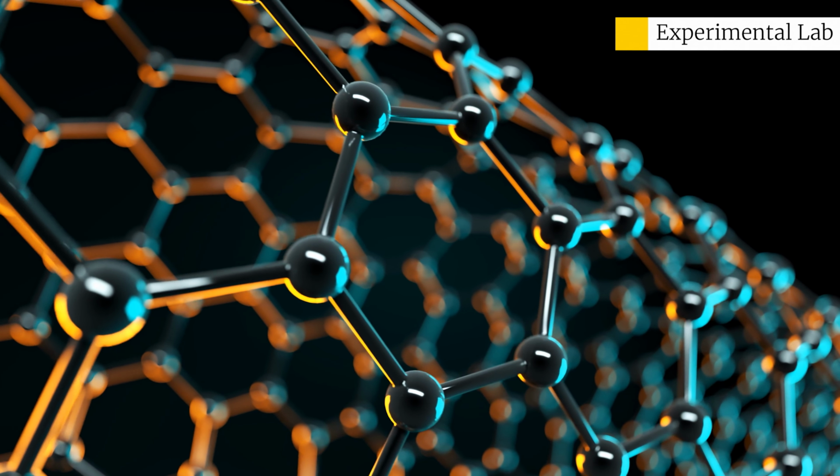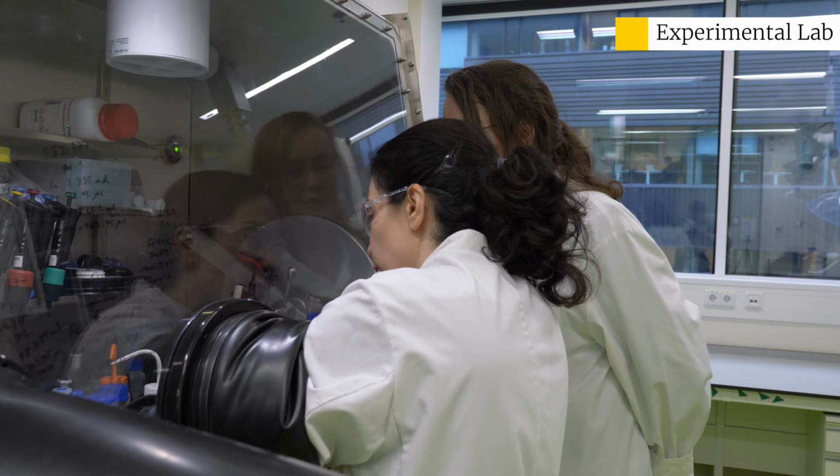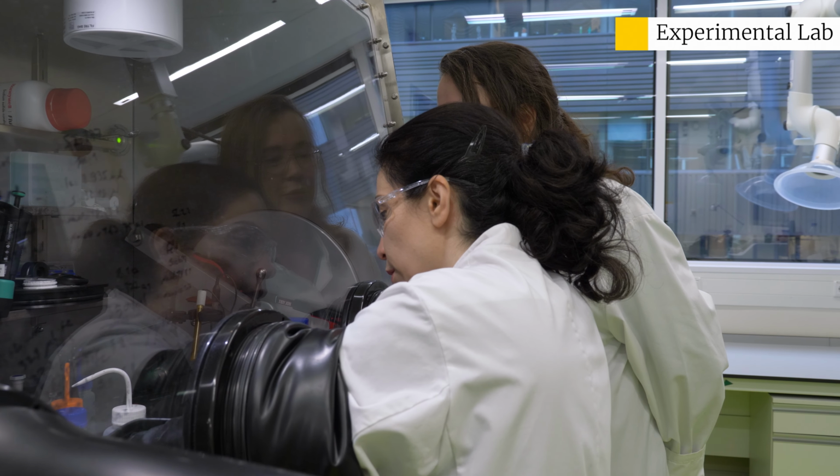Raman spectroscopy is a technique that uses blue, red, or green laser light to stimulate vibrations in solids, gases, and liquids. The vibrations are characterized by the solid's chemistry and its structure. That means that if we can map the vibrations, we can identify different materials. In geoscience, we use Raman spectroscopy to look at rocks, to characterize the different components of meteorites, and to identify the things that we synthesize in the laboratory.